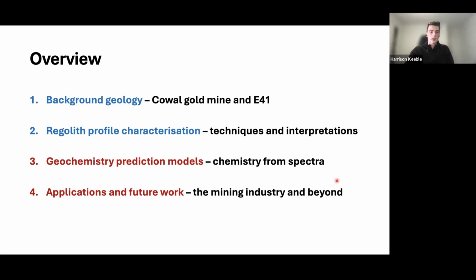Then the second part of my presentation will focus on the other part of my honours, which was looking at predicting geochemistry and some models for that purely from spectral data, and particularly FTIR spectral data. And finally, I'll conclude with a few applications and future work for the FTIR.